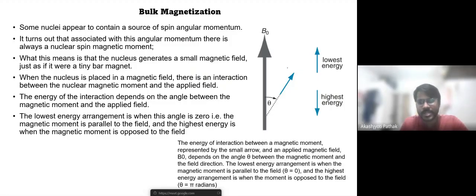It is basically as just defined: all the nuclei will have a particular nuclear magnetic moment, and each of these nuclear magnetic moments is oriented in different directions. Because the nuclei are spinning, each nucleus will produce a local magnetic field. When you sum up all these local magnetic fields, the total will have components in the XY direction and components in the Z direction.